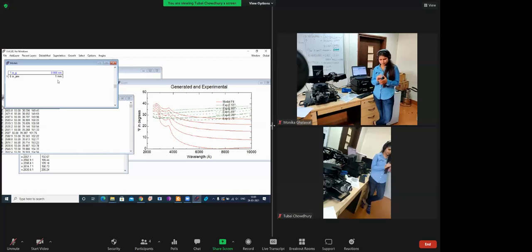But my point is, the tungsten model is already well reported. So why should I go for a Cauchy model if it's well reported? The Cauchy model is not a model for anything. It's just a mathematical formula to match whatever information is there. It just gives me ABC constants.